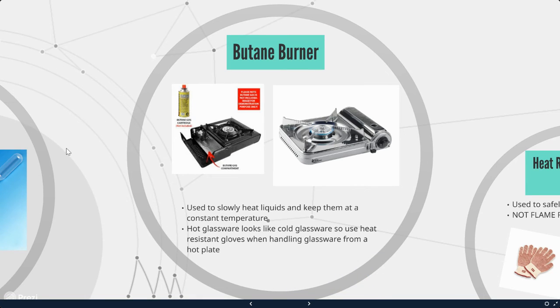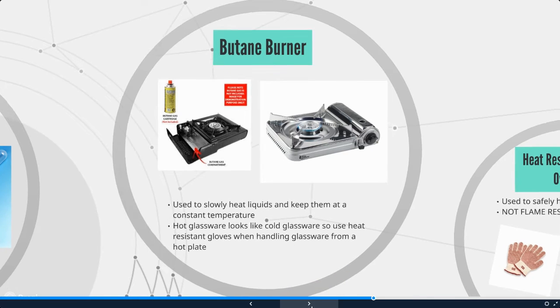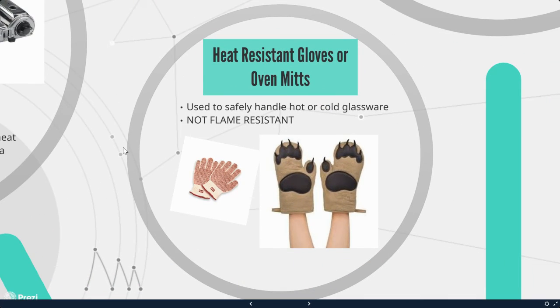Next, we have butane burners, though we're not going to be using butane in this class — we'll mostly be using our new induction cooktops. Normally, butane burners are used to slowly heat liquids and keep them at a constant temperature. Hot glassware looks like cold glassware, so use heat resistant gloves when handling glassware from a hot plate. You always want to make sure when heating liquid in glassware that you're using test tube holders or heat resistant gloves. Heat resistant gloves are not flame resistant — they still can catch on fire — so keep them away from any open flames.